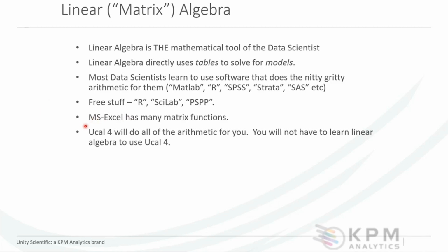Okay. And Microsoft Excel even has many of these matrix functions. So for the mathematical wizards out there, or people that just have a genuine interest in this, you can actually go in and do some of these calculations in Excel. UCAL4 does this for you, thank goodness.